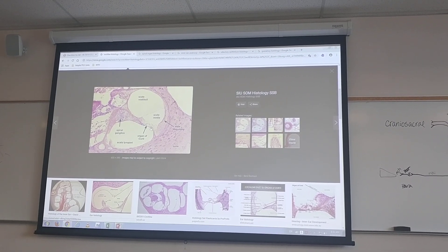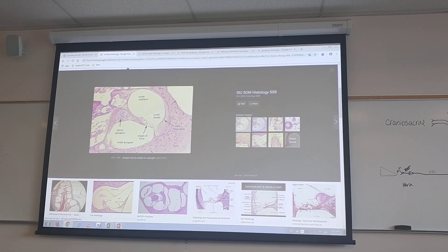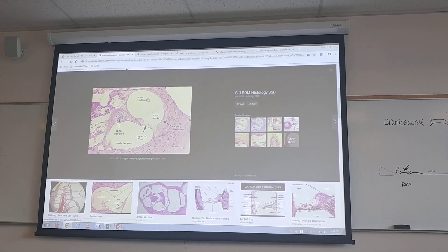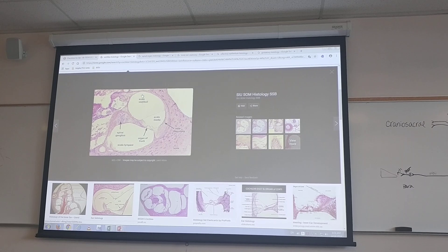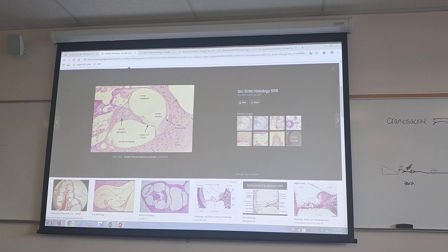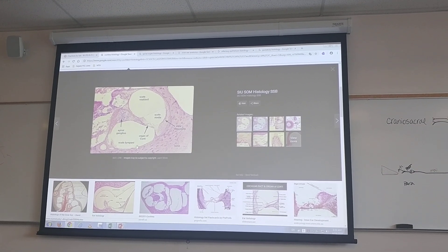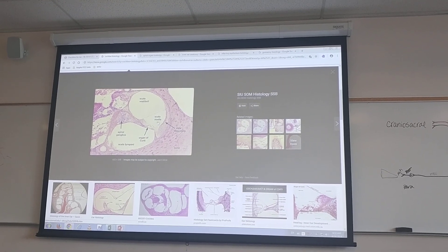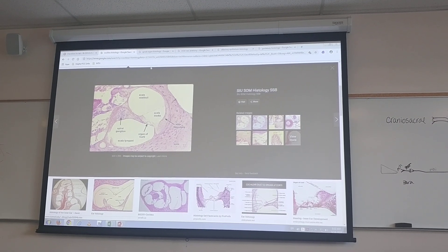Inside the cochlear duct is the spiral organ — this is where hearing takes place. On this slide you also want to know that the vestibular duct carries perilymph, the cochlear duct carries endolymph, and the tympanic duct carries perilymph. So it's perilymph, perilymph, and endolymph. Now let's look at the spiral organ of Corti.